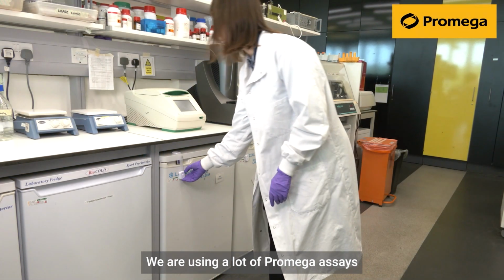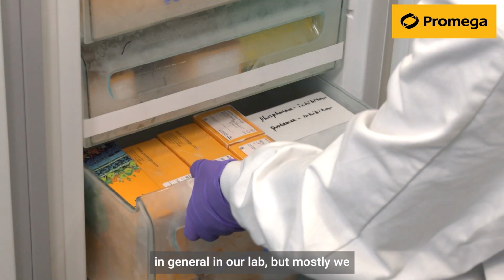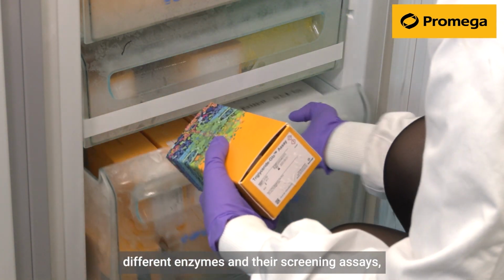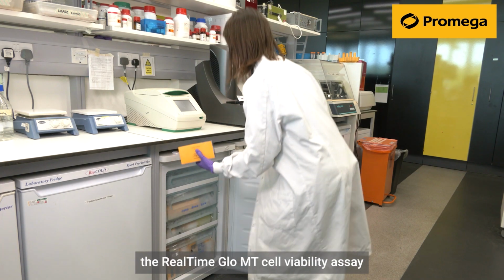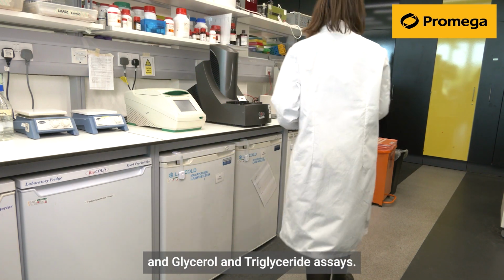We're using a lot of Promega assays in general in our lab, but mostly we were focusing on cytochrome P450, different enzymes and their screening assays, the RealTime-Glo MT viability assay, and glycerol and triglyceride assays.